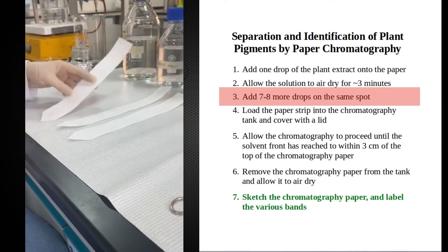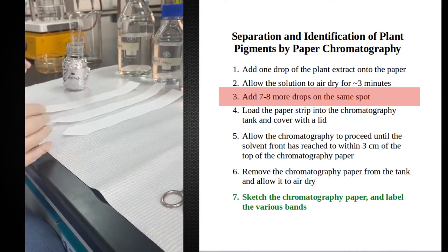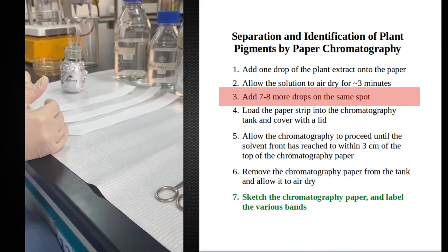Usually the way we do it is we put one drop and then we leave the papers for three minutes, then we put the other drop. So we will wait for these to dry and then we will add another one.